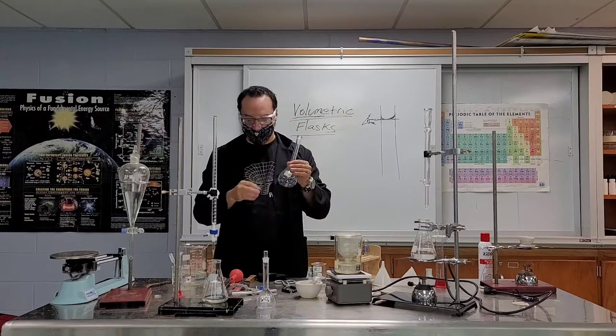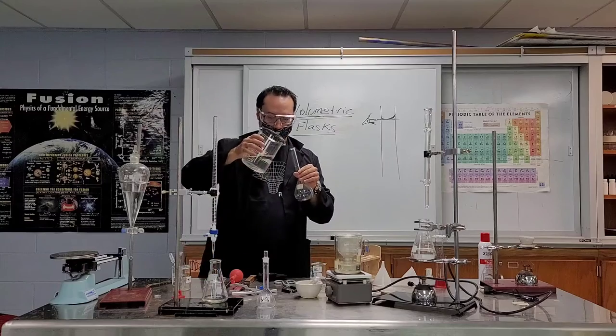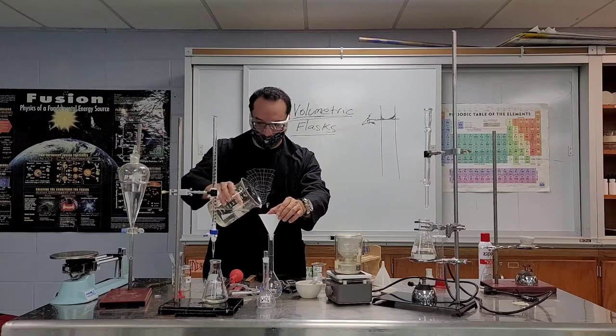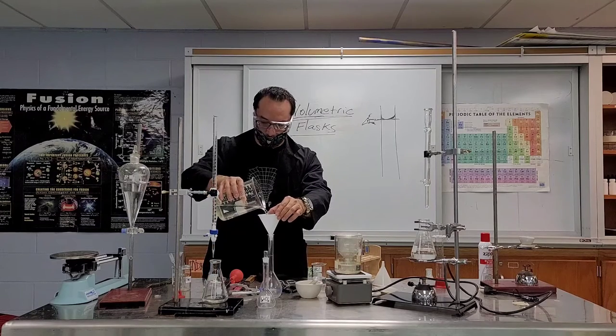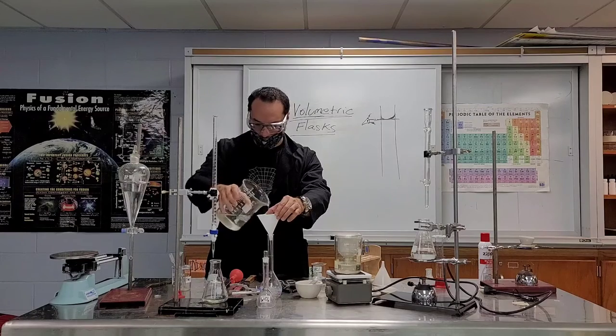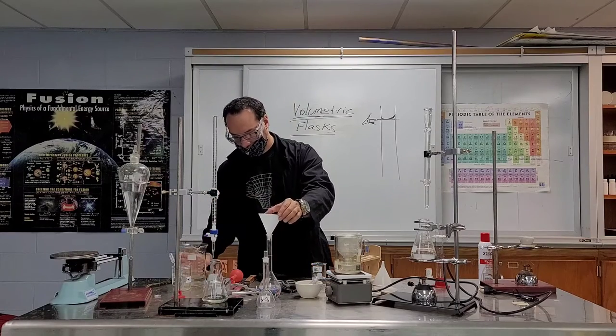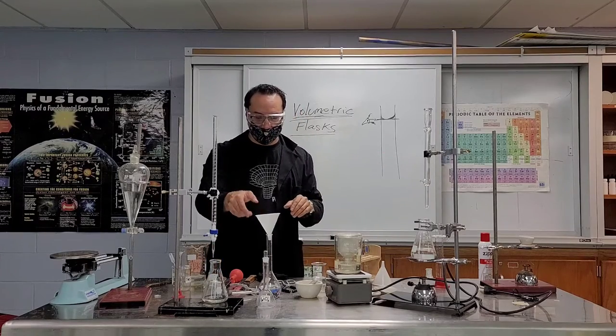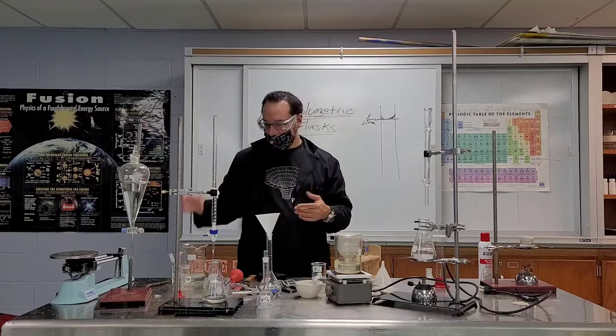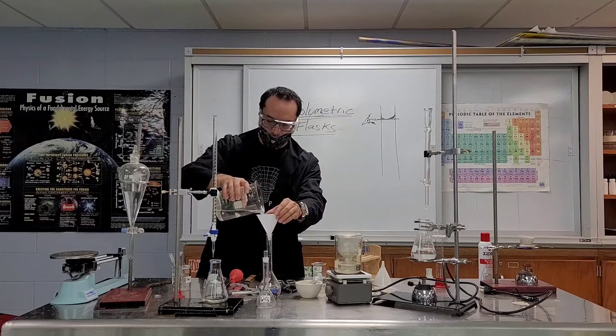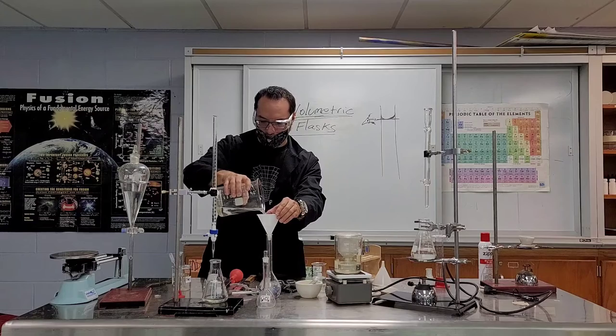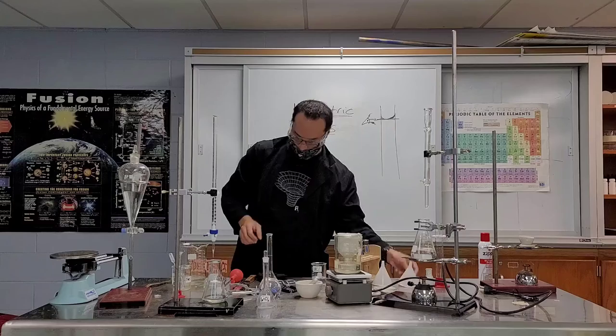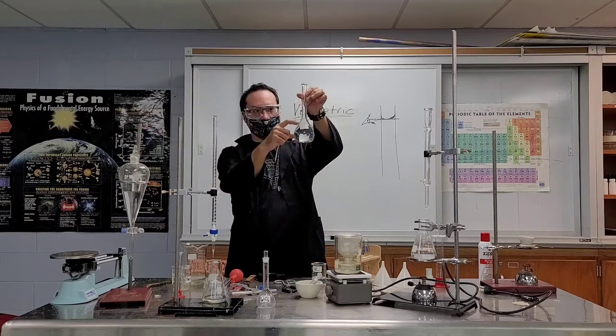You use these to make a mixture. The smartest way to do it is use a funnel, which is one of the things we're coming up to. You add some water, then let's say you have a chemical, maybe a salt solid. You pour that through the funnel, then pour more water through the funnel, and once you know that you have the right amount of chemical that you want to dissolve, carefully see how I'm getting pretty filled up there.